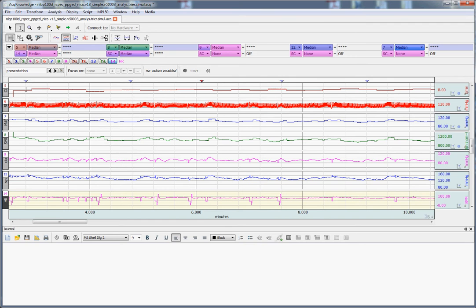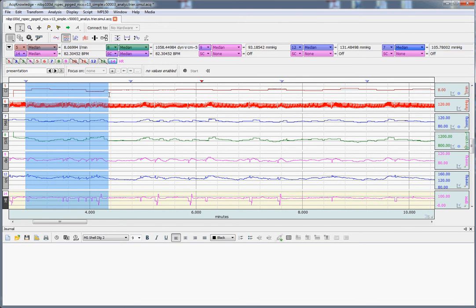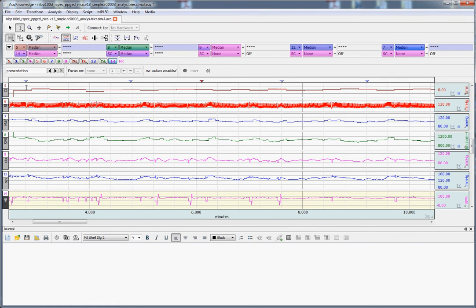And suppose here that you want to, you can do many things here, but for example, you want to measure various mean or median pressures and cardiac outputs and systemic vascular resistance, say from a certain time from each start of the phase. In this example, I have a small file, so let's suppose that from each such start I want a 1 minute median average of, for example, these pressures and cardiac outputs. Then I will just show how you can do this. This is one way of doing it.